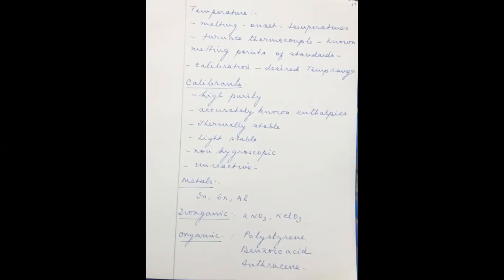Number five, it should be non-hygroscopic. I have already told you what is hygroscopic. Hygroscopic means which can absorb moisture and become very sticky. It is also called deliquescent, and opposite to deliquescent is efflorescent, the substances which will lose their water content and become dry. And then it has to be unreactive. So these are all the important characteristics of the calibrants used in differential scanning calorimetry.